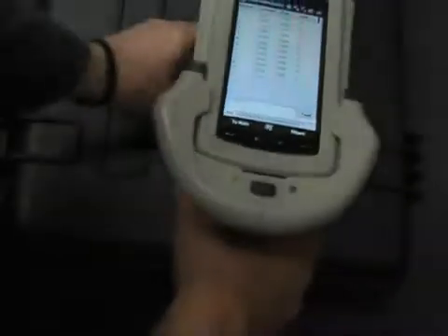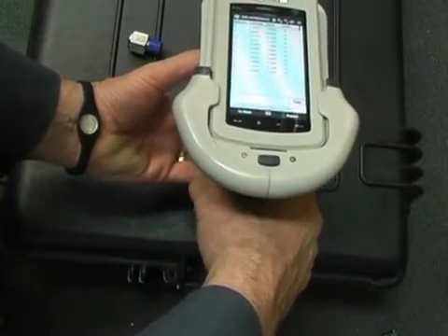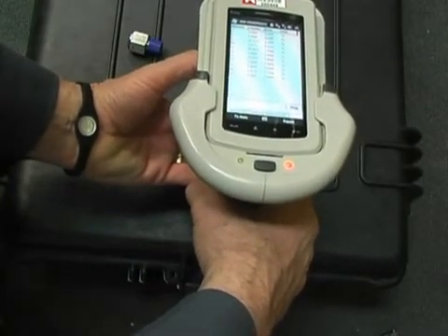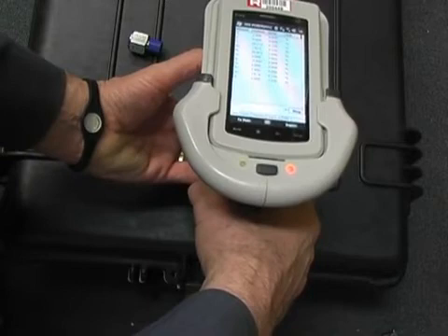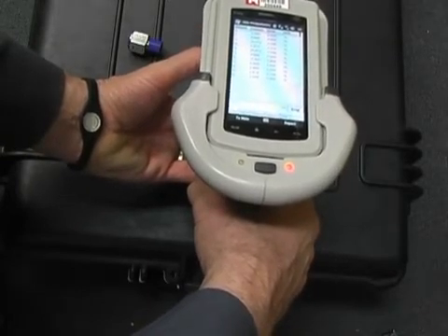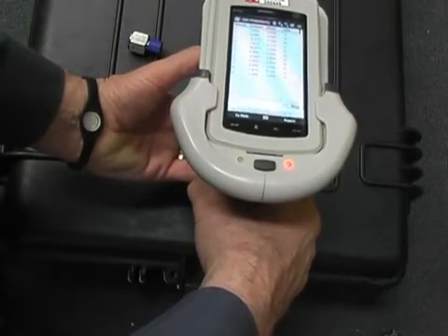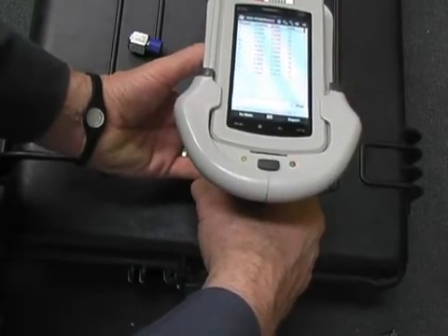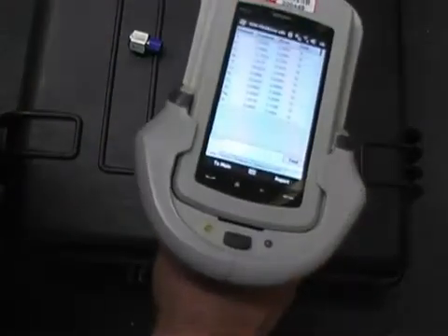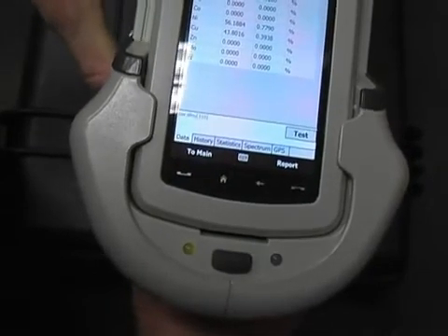Now I'll test my other test piece here. Point it at it at a fairly close distance and pull the trigger. Test light comes on. Test is counting down. Test is completed — release the trigger. This is matched to 310 stainless.